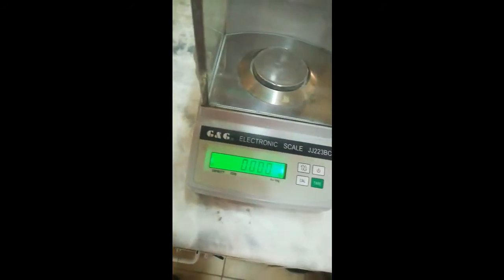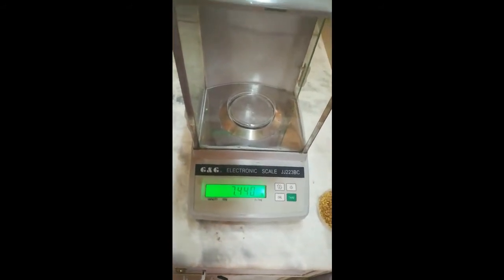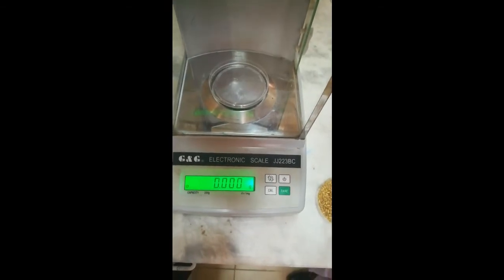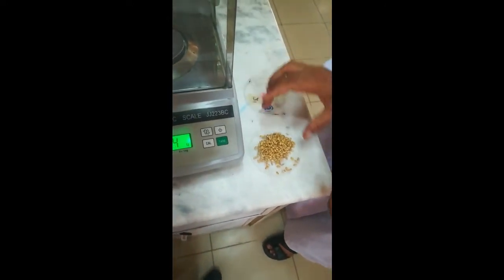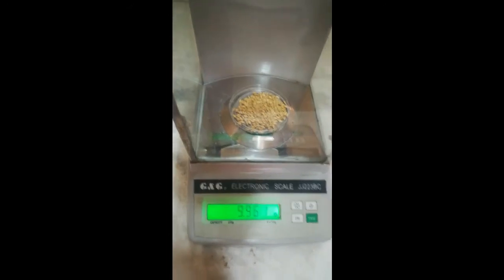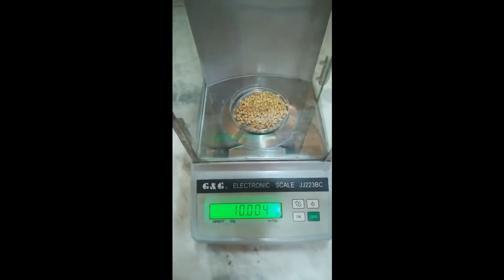For measurement, we will use a flat bottom battery plate. The weight of the empty battery plate is 7.44 grams. We will tare its weight to exactly measure the weight of the wheat grain sample. The weight of this wheat grain sample is 10 grams.